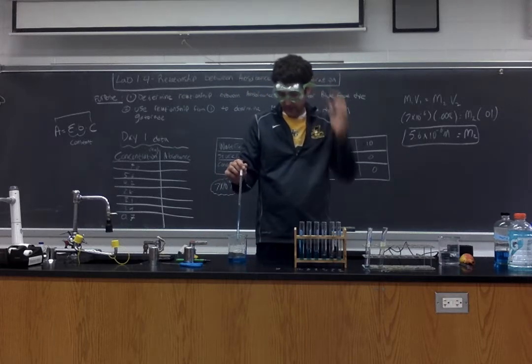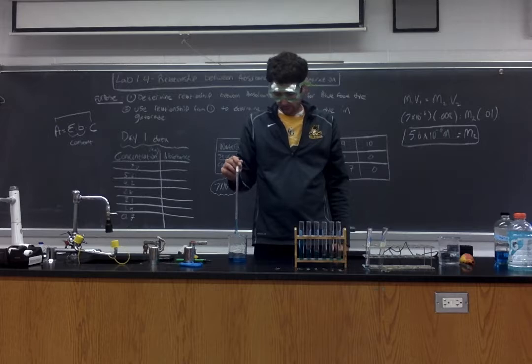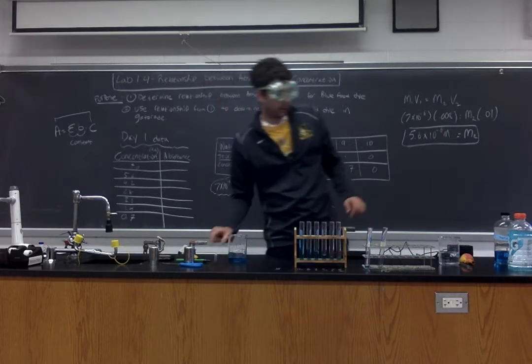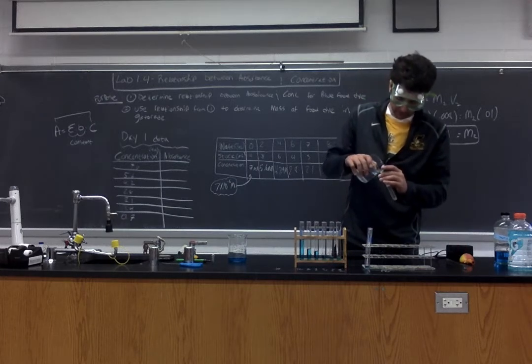So I'm done with all of my stock. Now time to add deionized water to all of these solutions as well. The last solution is only deionized water, so I can start by filling that up.